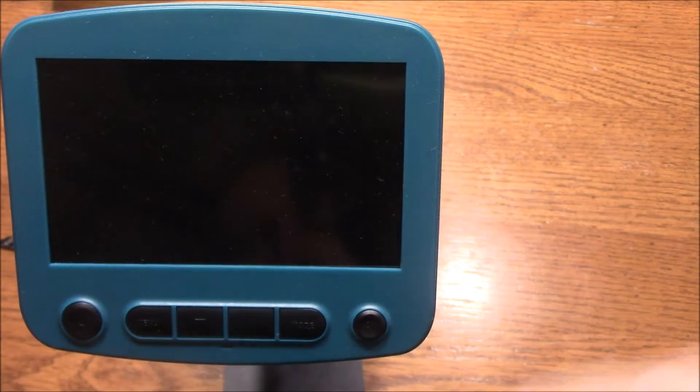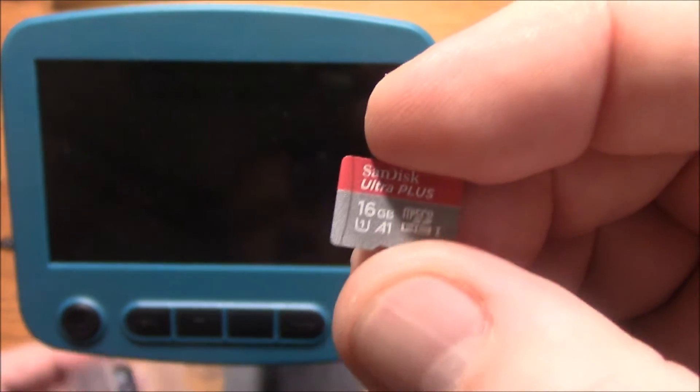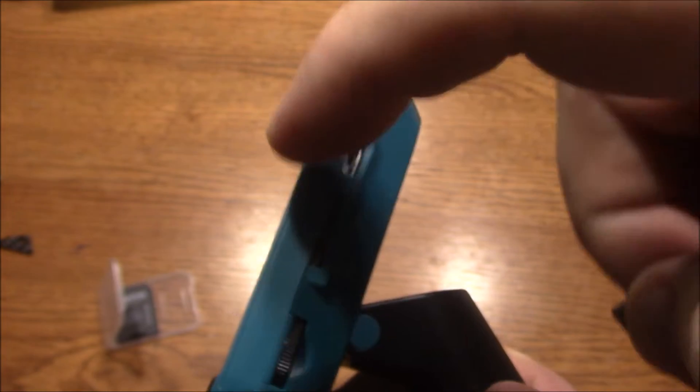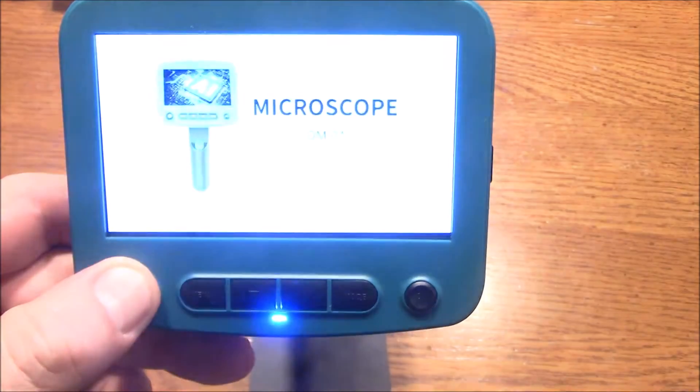The website says this supports up to a 64 gig micro SD card. I don't have 64, I've got a 16 though, so I'm going to go ahead and stick this in here. You've got to be careful when you're inserting it into the SD card slot that you actually put it into the slot, which is the side over here by the monitor. You can slide it down past the slot and your card's going to be stuck inside, so don't do that. Once it's in, the micro SD card picture shows up here, which lets us know that it's actually reading the card correctly.